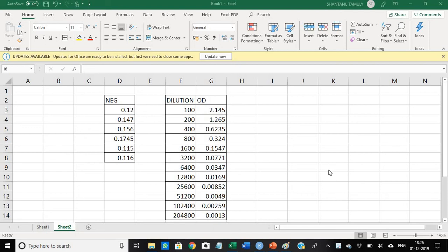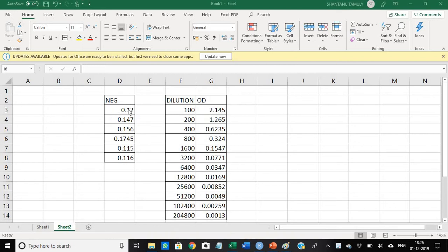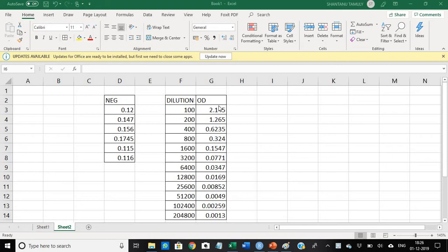Hello friends, so today I'm going to demonstrate how to calculate the ELISA titer. In this Excel sheet, I have drawn my negative control. I have taken six numbers of the negative control OD. This is a control serum I have taken, and this is the OD value of my sample serum.